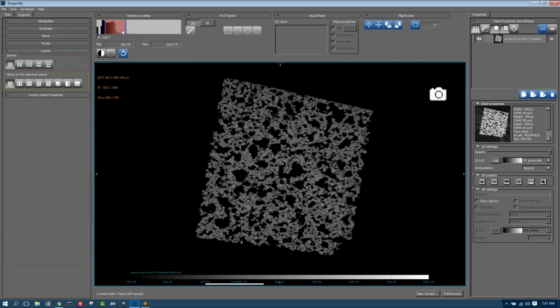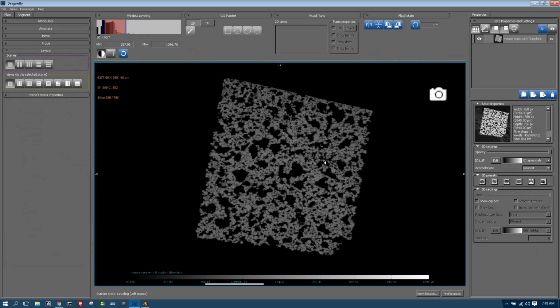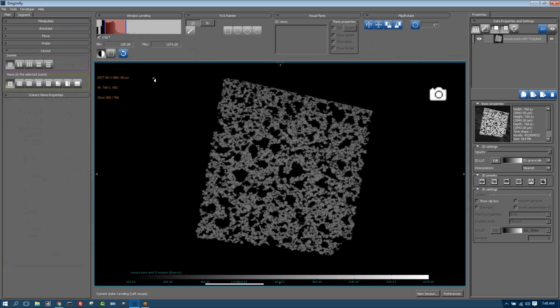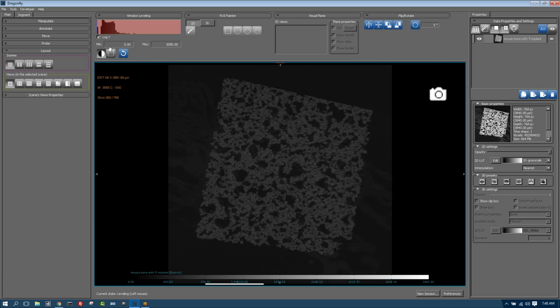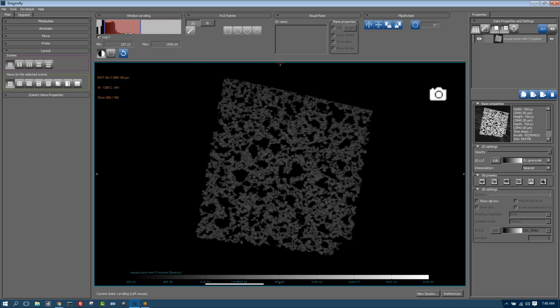Now, besides doing that, you can use what we call our window leveling mode. And for example, if I click on this button, I'll be in that window leveling state, which means a vertical drag is brightness and a horizontal drag is contrast. So you can adjust both at the same time. So you can map back and forth using either this widget or this widget. And you can reset it anytime you want as well. The brightness and contrast is one of those behaviors that's accessible many places in the application.